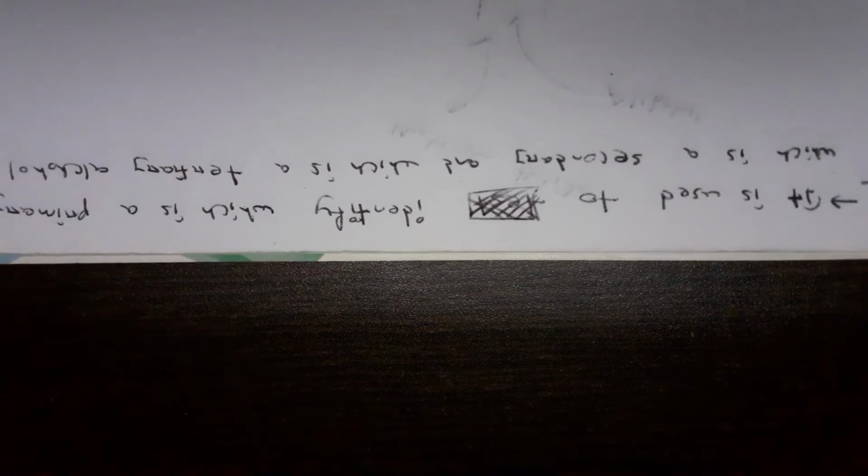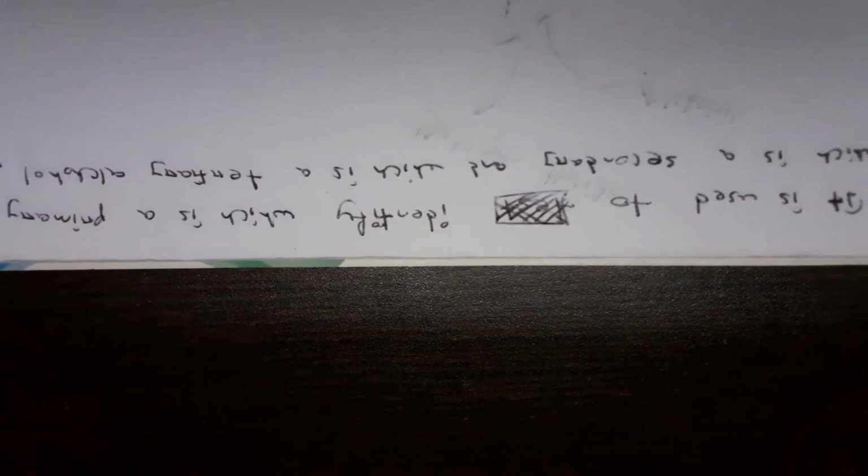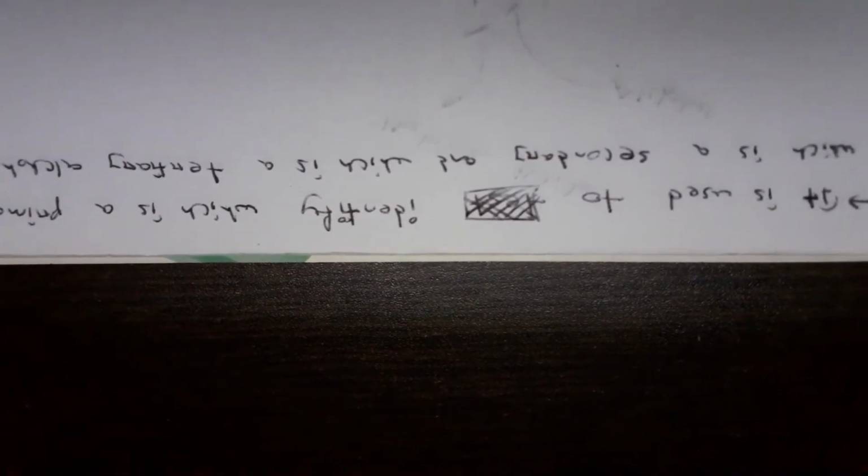Hello everyone. Today we are going to learn about the Lucas test of alcohols. The Lucas test is mainly used to identify which is a primary, which is a secondary, and which is a tertiary alcohol, or in other words, it is used to identify which is a 1 degree, which is a 2 degree, and which is a 3 degree alcohol.